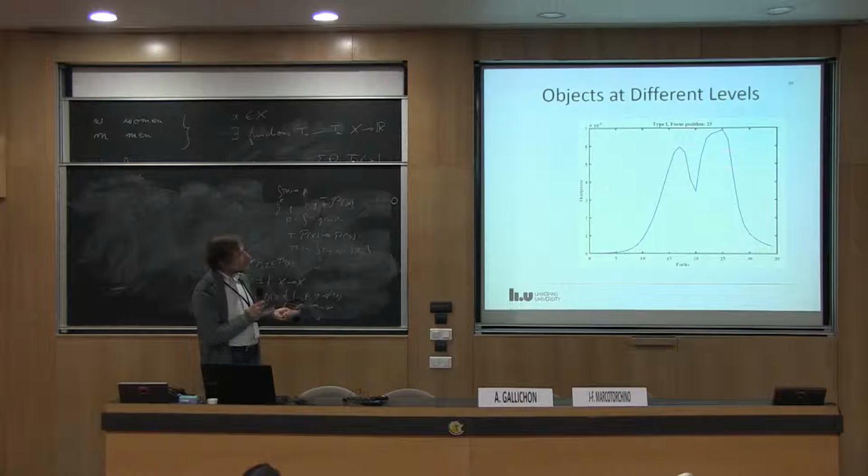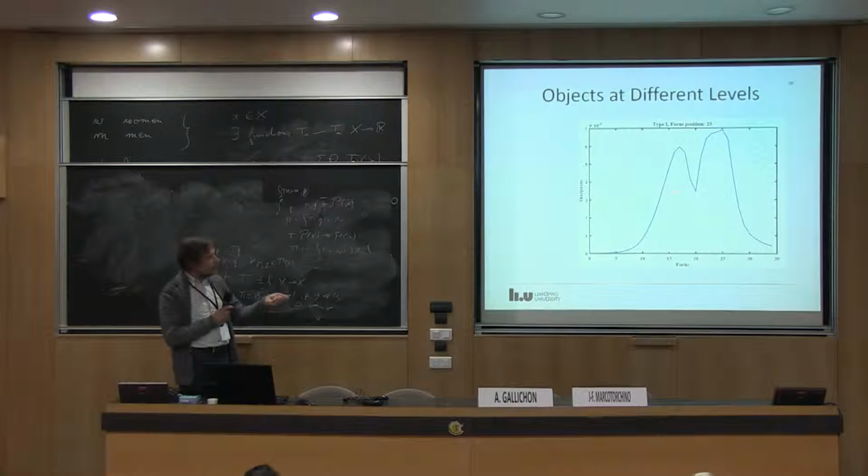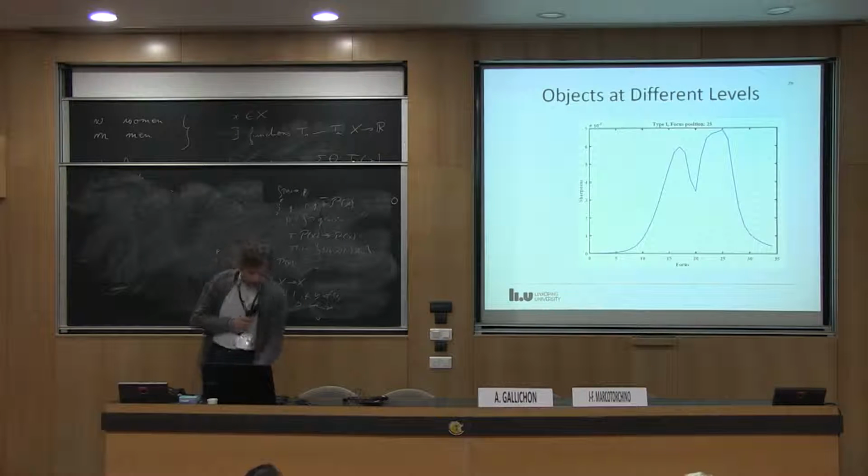If you look at this sequence here, then you see the cell is not located in one slice, but parts of the cells are in different positions. So the cell is lying like this and not like this. So you get the highest contribution just outside the interval. But that's probably okay.